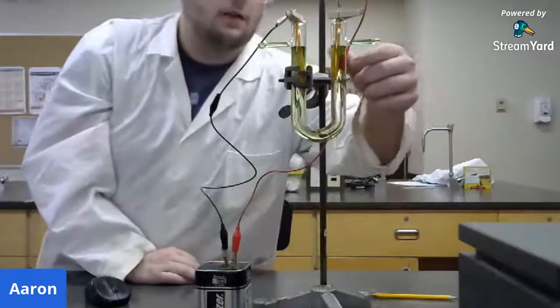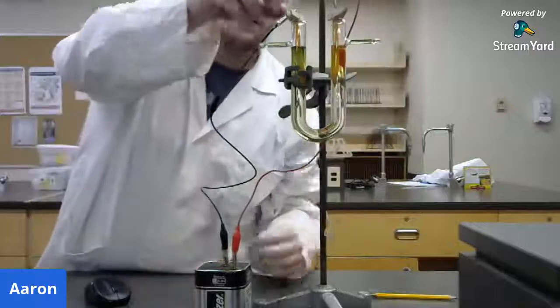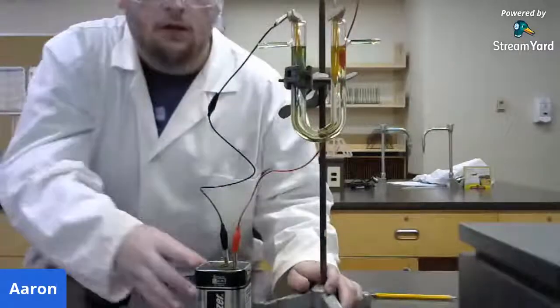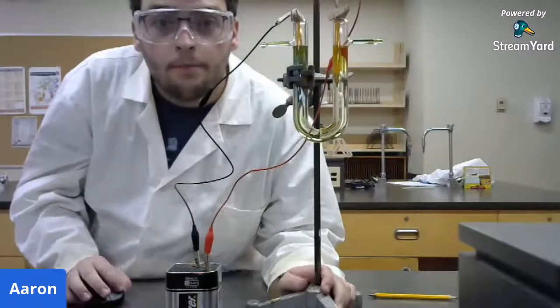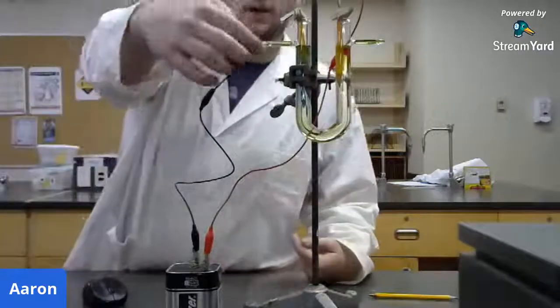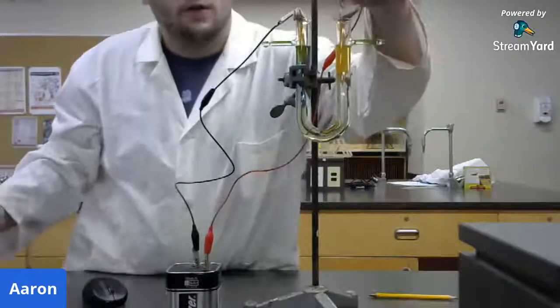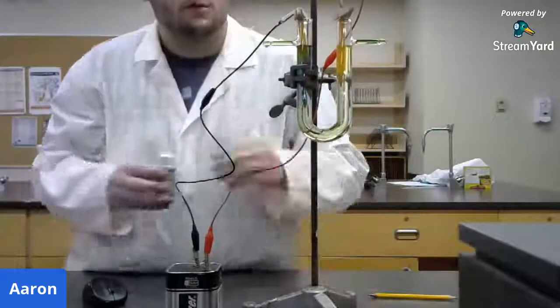Okay, I see some bubbles now. We might work yet. Oh, there we go. Now we're starting to see. Yeah, you can see that this side here is actually a lot more blue and purple, and this one is getting a little more yellow. And eventually this side's going to turn red. And it looks like it's just about there.